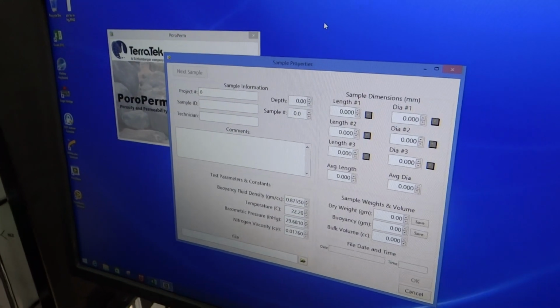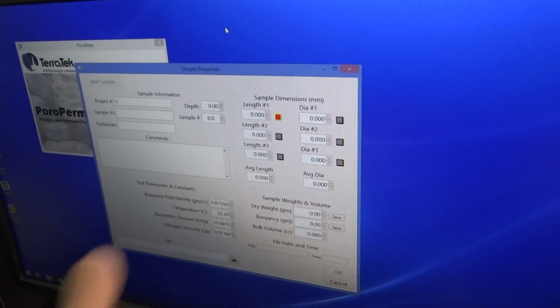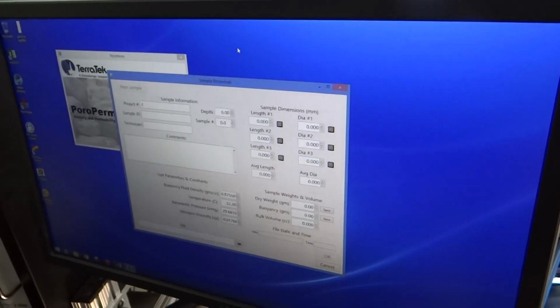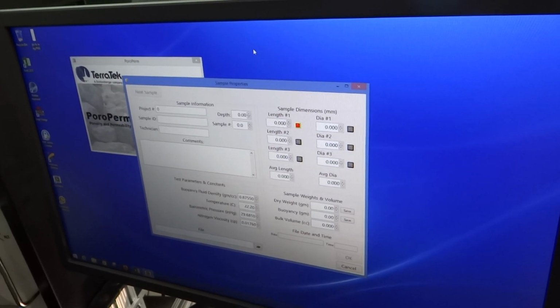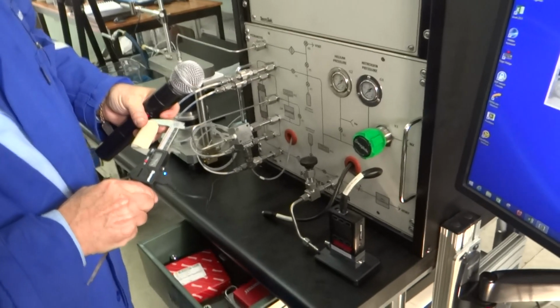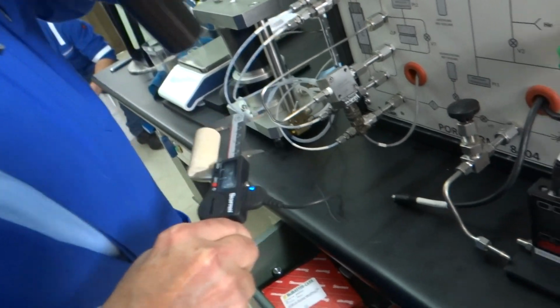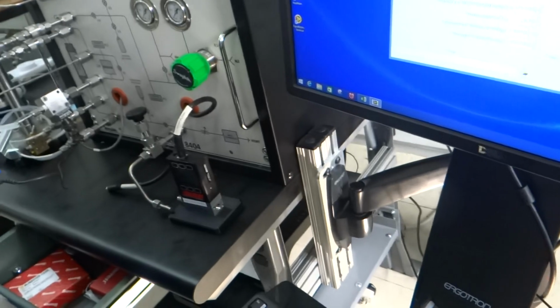Okay. So we measure 3 times to get the average, both lengths and diameters. This we measure and then we insert, or it's automatic. It's automatic. When you do a measurement, like the length, you press this button, inches to millimeter, and it'll show up there.